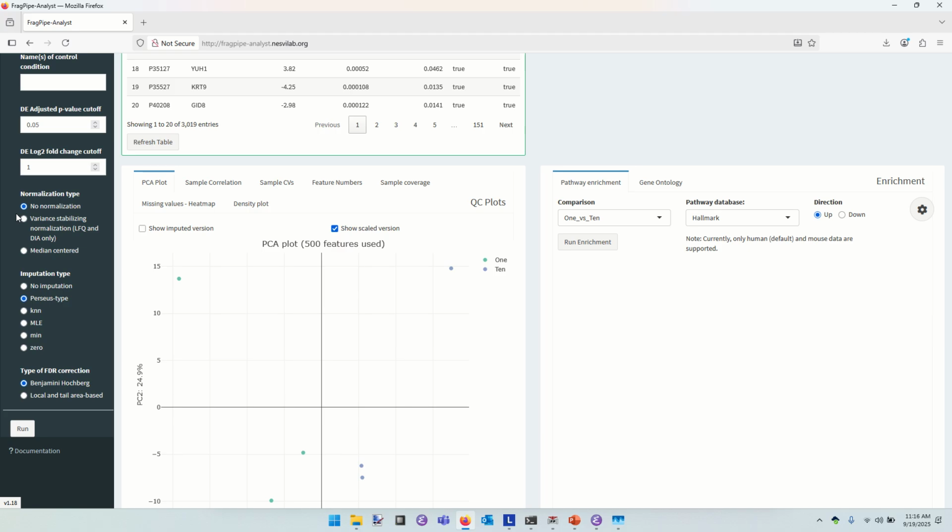If you had quite variable response from the instrument, maybe let's take an example like I was cutting bands out of a gel, and maybe in the one case I got a bit more protein harvested from the gel band than in the other, then I'm probably going to have some sort of normalization to adjust for the different quantity of protein. This is not something where I have a hill I would die on.